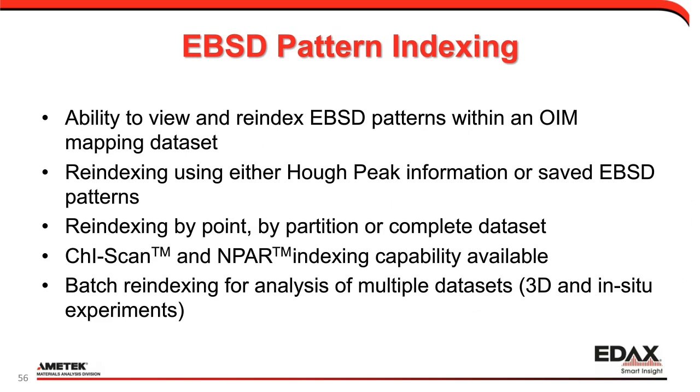Probably the biggest feature we've introduced is EBSD pattern indexing within OIM Analysis. So what we're able to do is re-index points, data, partitions, whatever we want to do within OIM Analysis. We don't have to do our re-scanning within the acquisition software anymore.